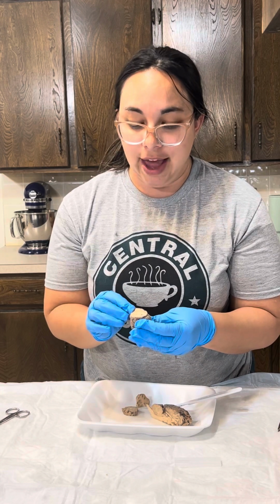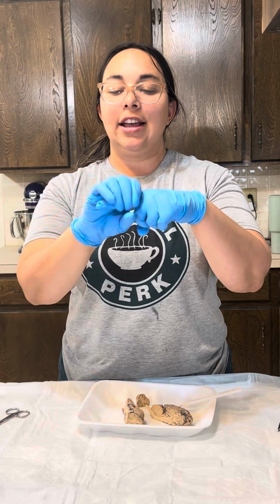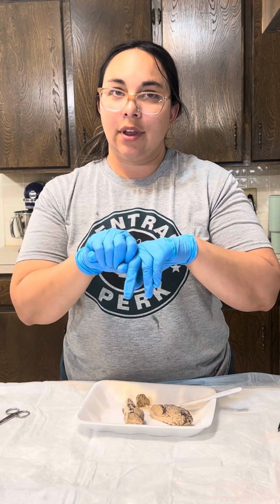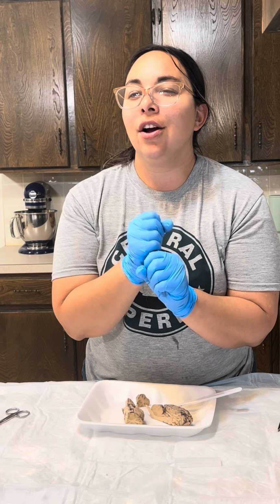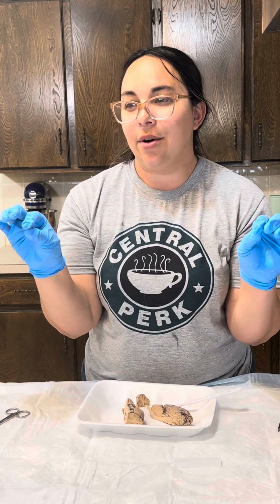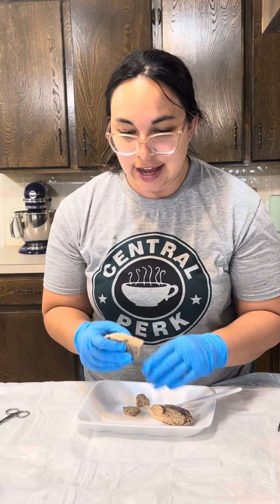The white matter is kind of like, if this is your neuron, it's got a protective layer on it. It's called myelinated axons. So it's like a wire with coating on it versus a wire without coating on it. Does that make sense? It makes it go faster, it conducts better. So that's what that is.